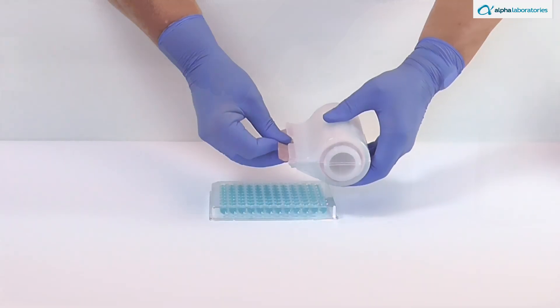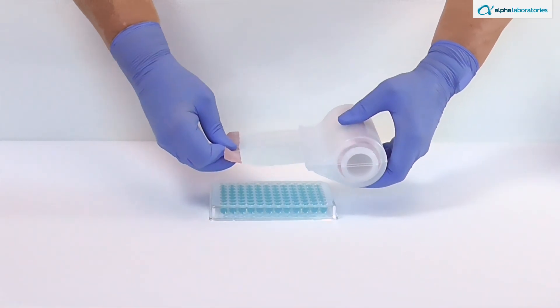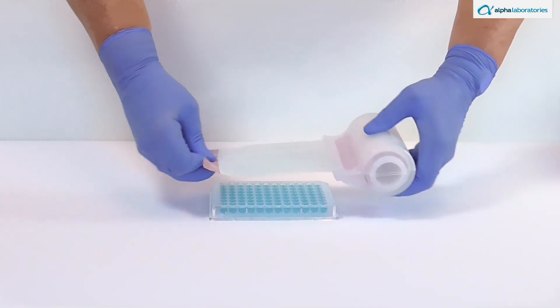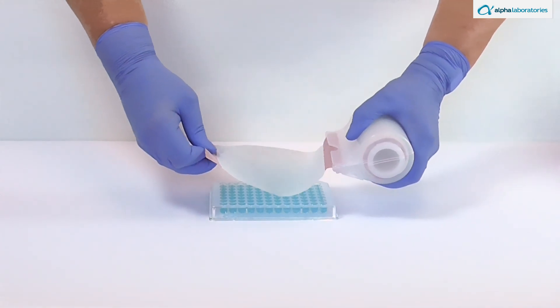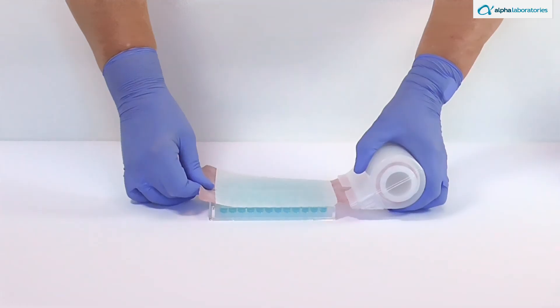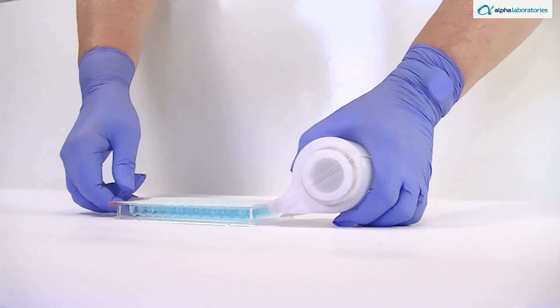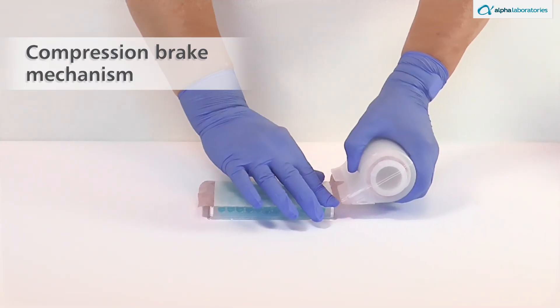Storage of the dispenser is made easy by standing it on the end hub. Each Seal Mate roll sheet is separated by a colored non-adhesive tab. These colored end tabs help position films on microplates, with perforations for easy separation. The tabs also act as visual markers to prevent premature film dispensing. The Seal Mate dispenser features a compression brake mechanism that stops the roll from turning as a sheet is separated.